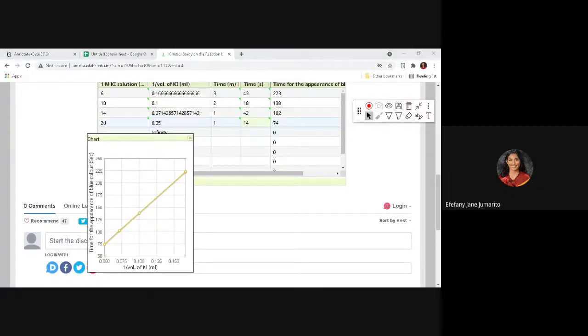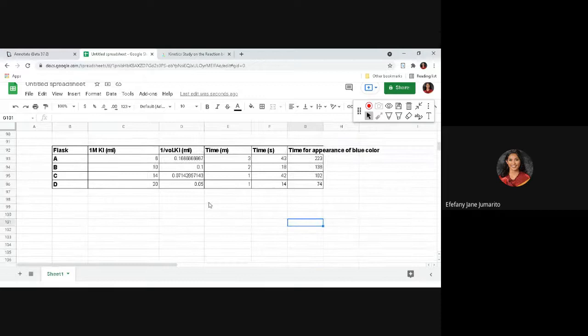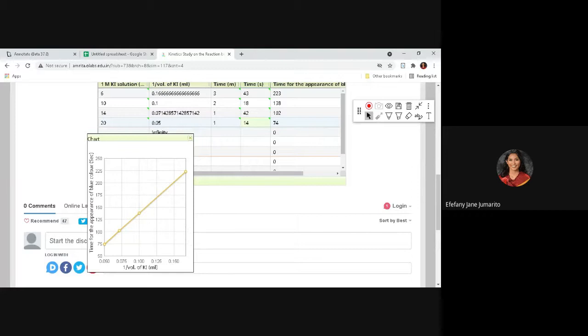Na-stress ko. Ma'am, pwede kana na lang na chart, ma'am? O sige ha, pero mag-video. Dapat makabalo pa mo sa Excel. Wait sa. We have this one. I'll give you the chart. Ba ako na yung screenshot. Kaniya to ang chart here. Then you use this one na. Snipping, no? We use this one.